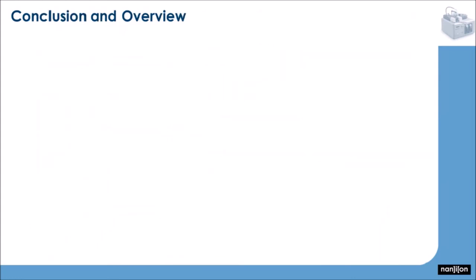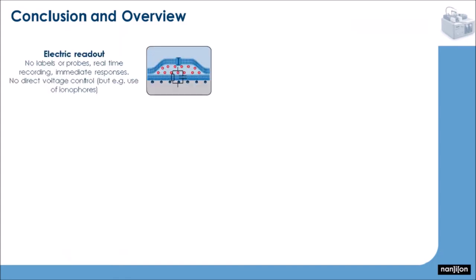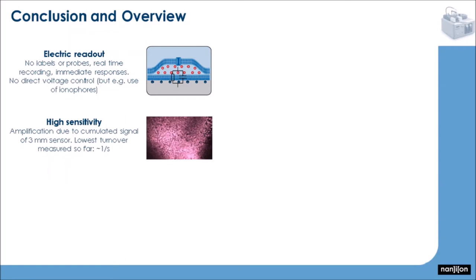With that, I would like to conclude and summarize. So SSM-based electrophysiology, as it is implemented by the SURFE, is an electric readout method. It doesn't require any labels or probes. It's in real time, and it has a very high sensitivity due to the sensor area of 3 millimeter.